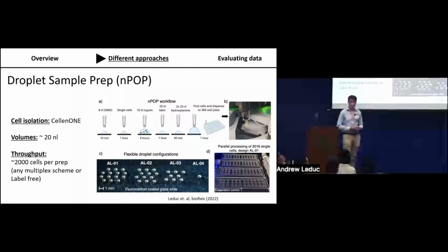Any other questions from the room? Yep. Hello, great talk. Also a question about the normalization. I was wondering if you compared the results with and without normalization, because normally if everything is reproducible without any normalization, the conclusion, at least the biology conclusion, should be the same.